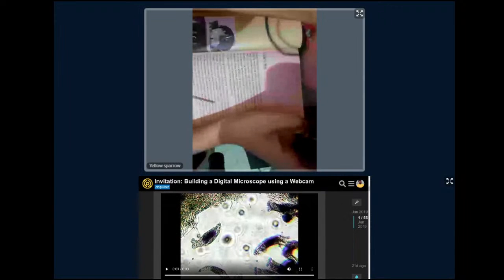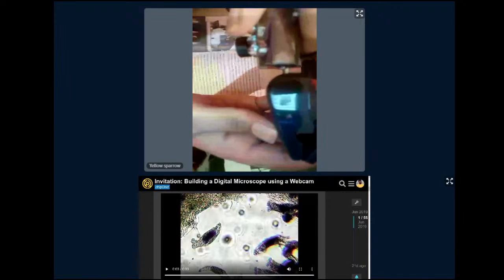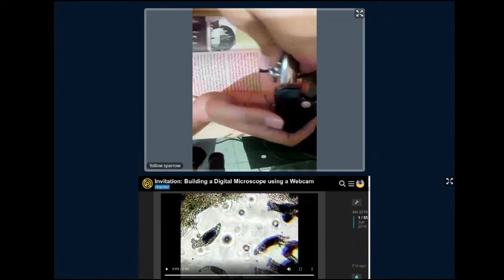Sir, here only one is there. We can't see in the vision. Okay. No, don't bring it too close because it's completely out of focus. This is, I think, good enough. I think it's an entirely plastic mounted thing. There are no screws.